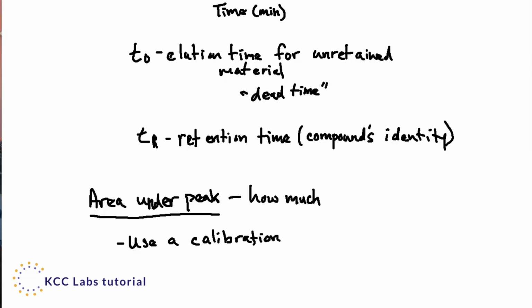It can be a little bit of trial and error when you're first setting up your calibration curve if you don't know a whole lot about your samples. But once you have a reliable one, you'll know the area under the peak for the various concentrations of lysine, and therefore you can determine the amount in any unknown sample going through. And you always know that it's lysine based on the retention time. So that would just be an example there.